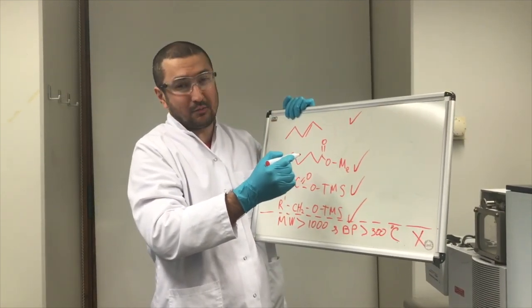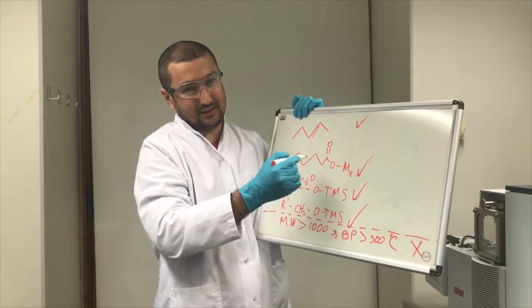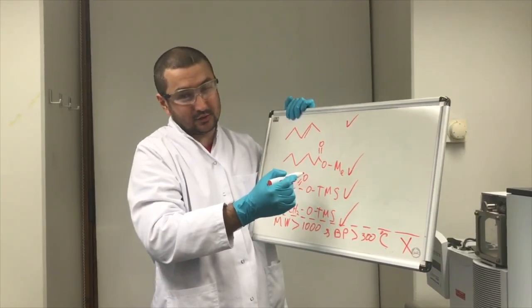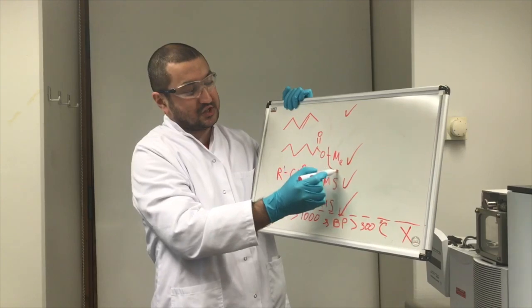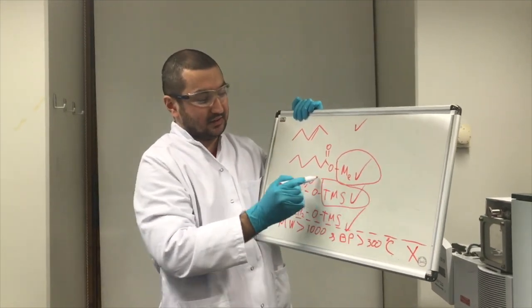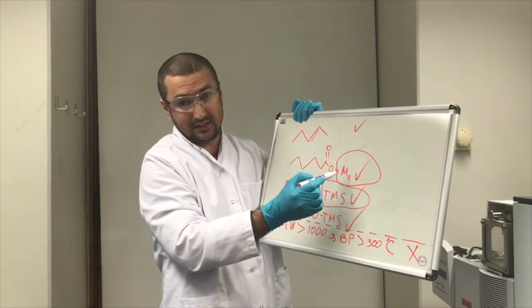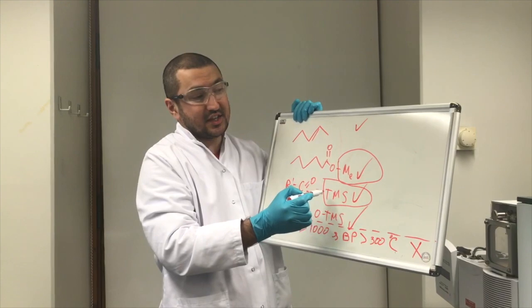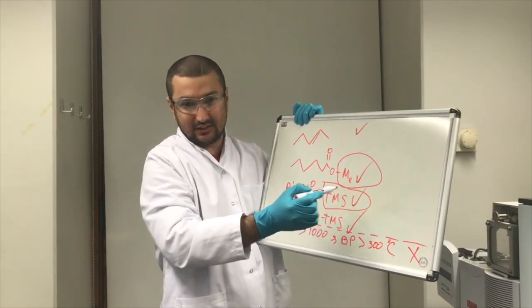And if the compounds have functional groups like carboxylic acid or hydroxyl groups, what we can also do is exchange their labile proton by methyl or TMS derivatives, trimethylsilyl, or just by methyl. We can do that by a simple chemical reaction and inject instead the derivatized compounds and detect by GC.